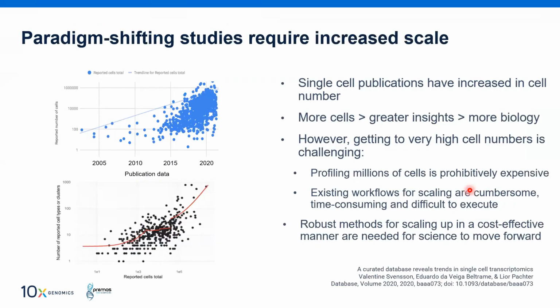Now, as things are moving forward, what 10x has observed is that before 2005, people were publishing data of 100 cells and more than that, and then slowly around 2010, 15, the story had just started where people are doing many cell samples. We can say million cell samples are coming up after 2020, between 2019 and 2020, and it's still going on.